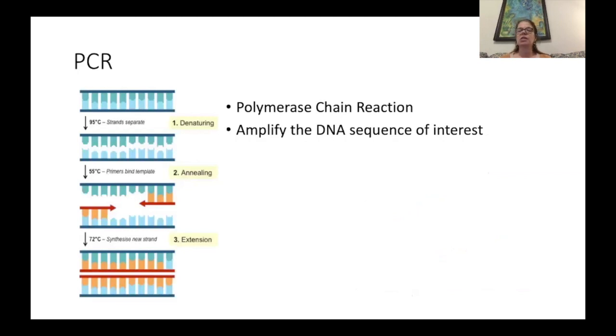Then we take that DNA and we're going to do PCR and amplify the DNA sequence of interest. Now, the DNA sequence that we use in this lab, and that's frequently used for very basic sequencing when you're just interested in identification of the organism on a pretty generic, maybe genus species level, or even just genus level, is amplification of the 16S ribosomal RNA gene.